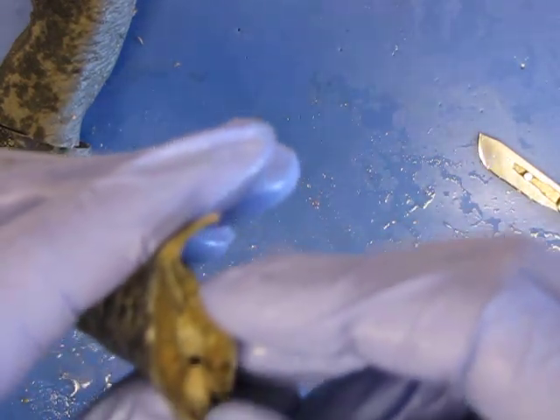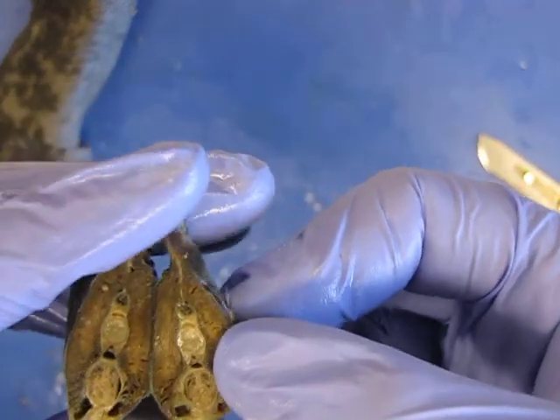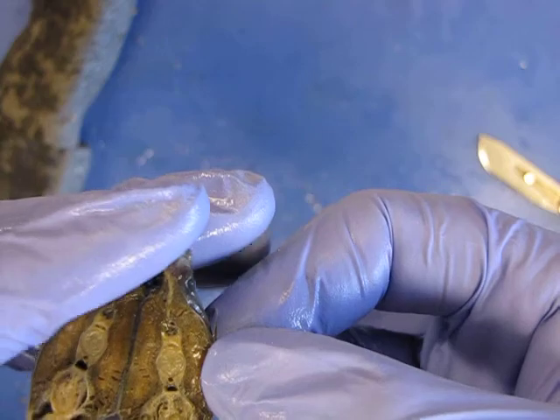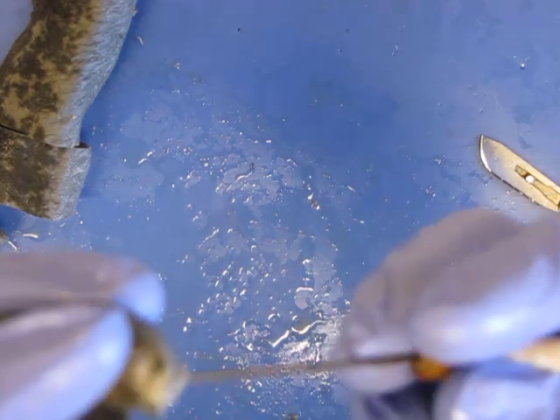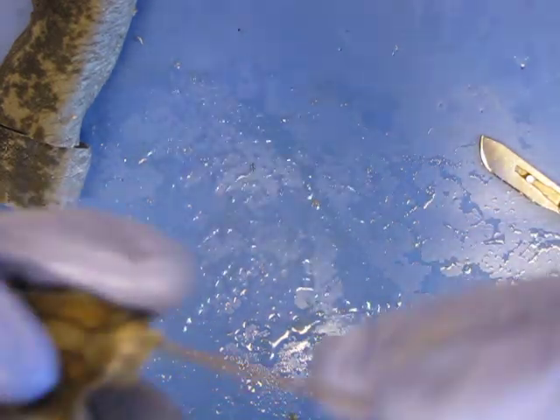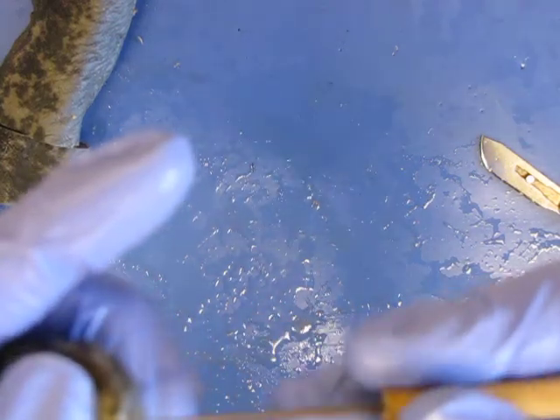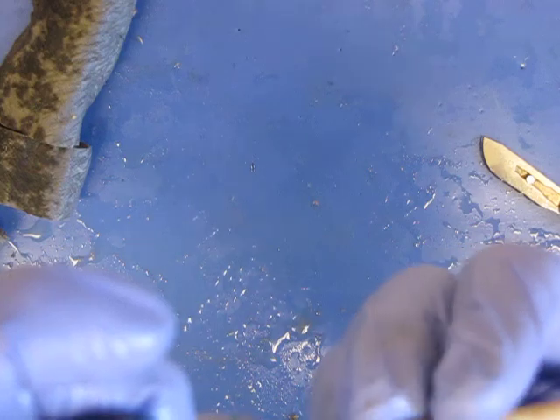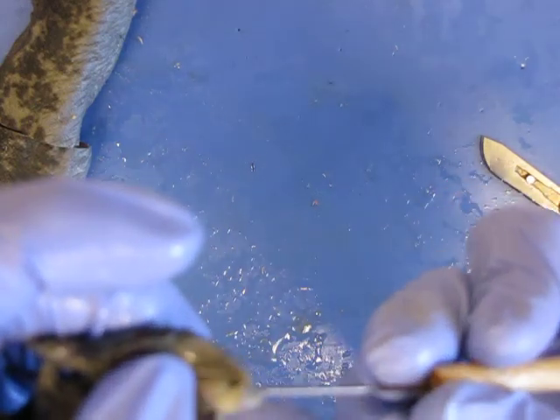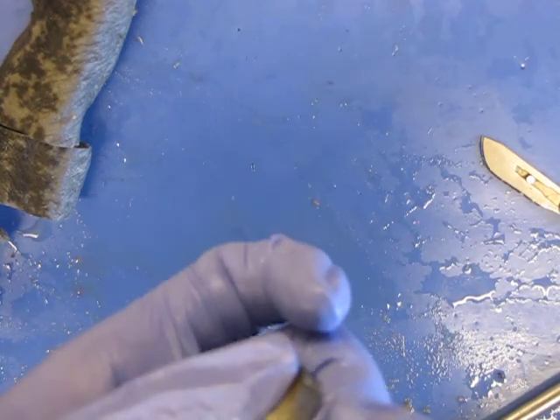Okay, so we know that's the urogenital papilla, or the genital papillae, where the archonephric ducts drain. If I take my teasing needle and work my way back, and I might not be able to do this, you know, like I said, each dissection is different, and you just kind of have to experiment with it and see what you can come up with. Sometimes you do these things and they come out really clear, and sometimes you don't.